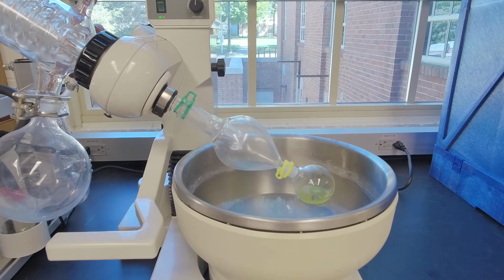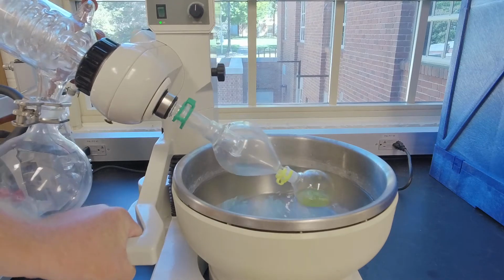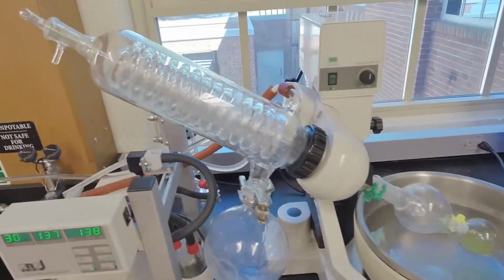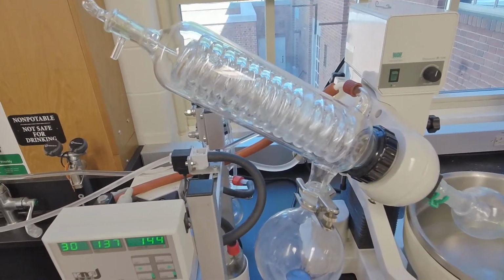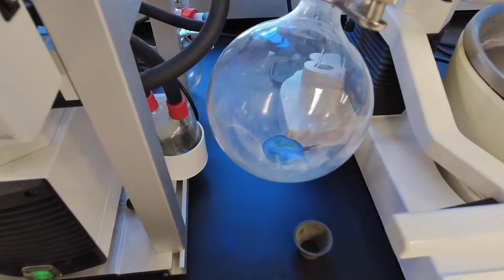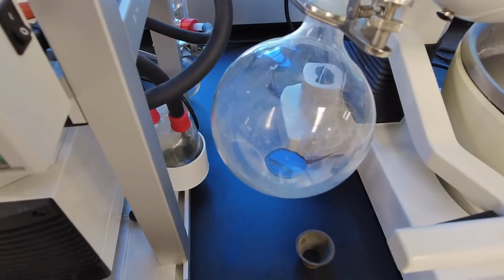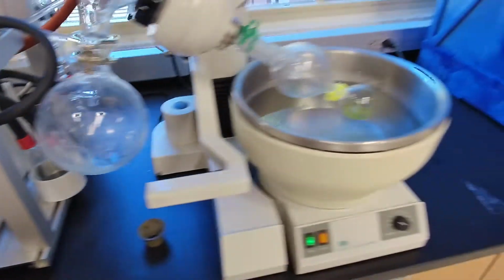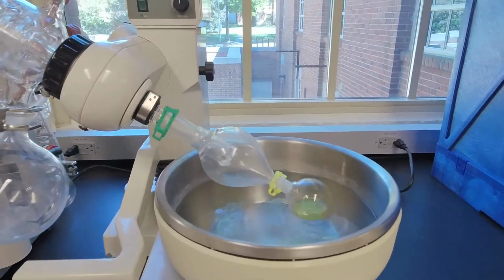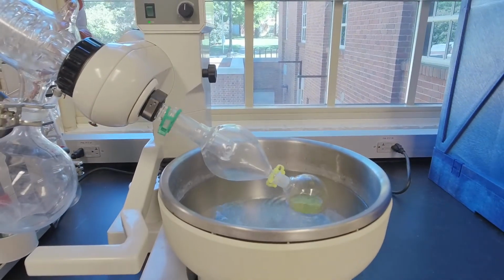Okay, like I said, the bath is just replacing the heat loss to evaporation. It's starting to condense a little better now. All right, we're getting more solvent there. We're starting to collect some solvent down in the collection flask. You can see some bubbling in the boiling flask.